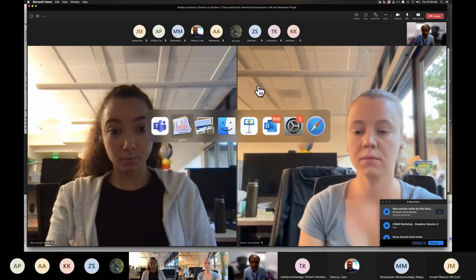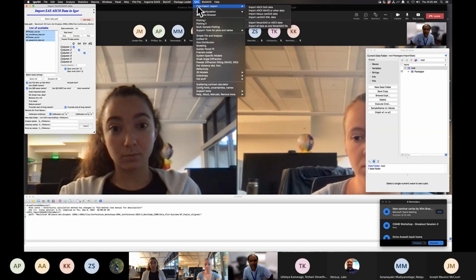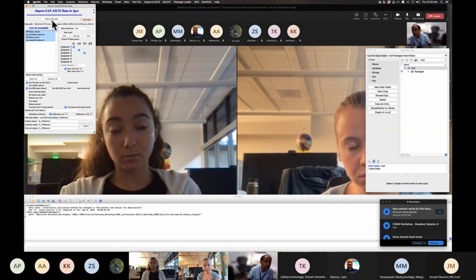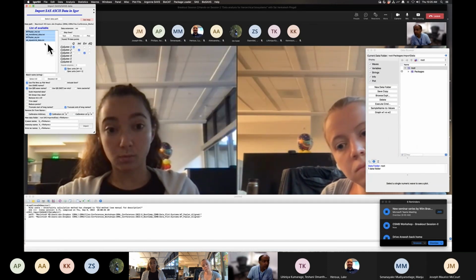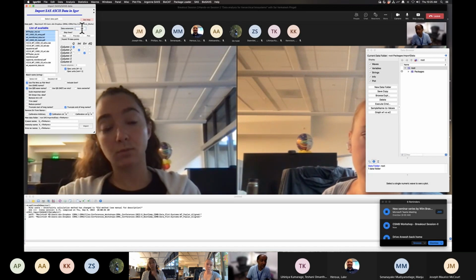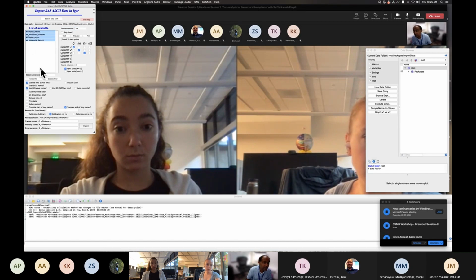Okay, so I'm going to get back. Basically, you go to SAS. You're going to then go with import SAS data. There are many options, as I call. This is the window that opens out. Then you need to select a folder where you have your data, which I have done, and that will cause all the data to show up. But really, the data we need is just not the PDFs and all. So I go to that data.